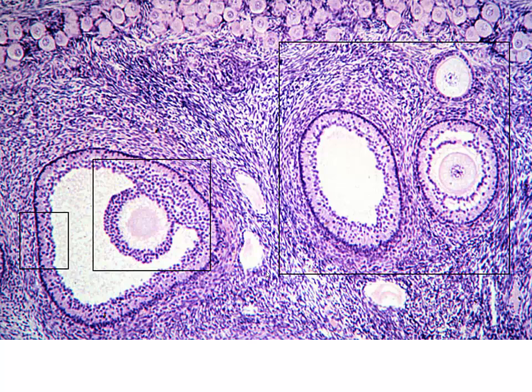Here we have some follicles in different stages as well. We can see our primordials along the surface, but what we're looking at, especially here, is going to be our secondary follicle. We can see these spaces where we're filling with liquor folliculi. We're disrupting the granulosa cells in our multiple layers. So this is going to be our secondary follicle.